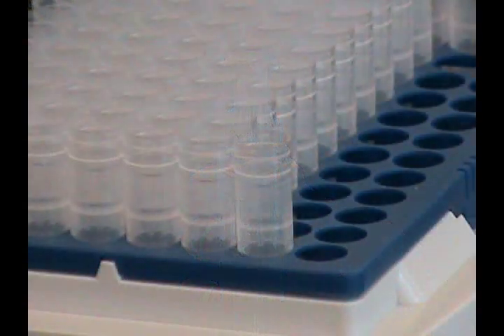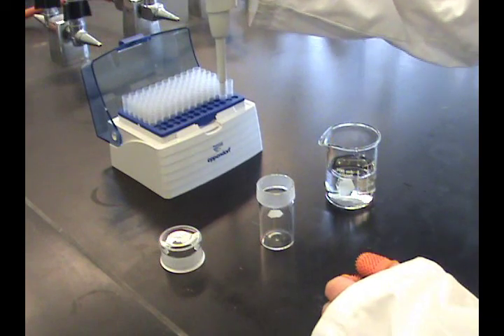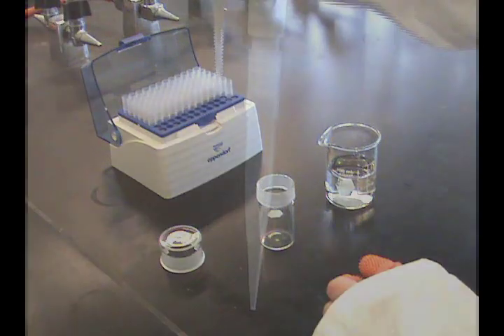Acquire the proper sized tips for the pipette to be used. Attach the tip by placing the plastic shaft of the pipette into the top of the tip and pressing down firmly. The tip should fit snugly but should not reach the bottom of the ejector arm.